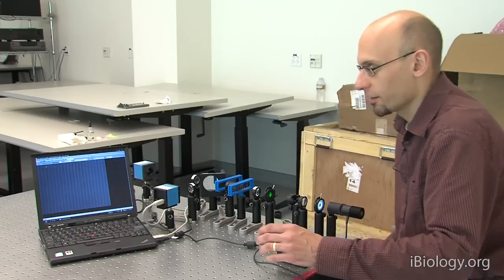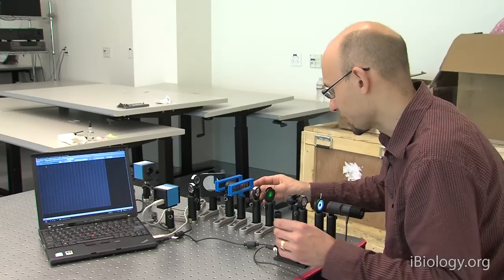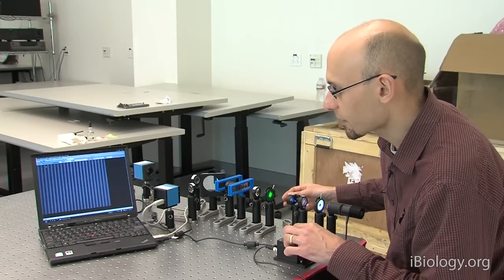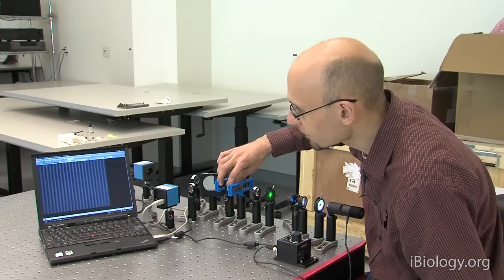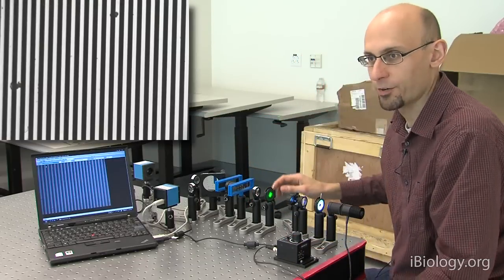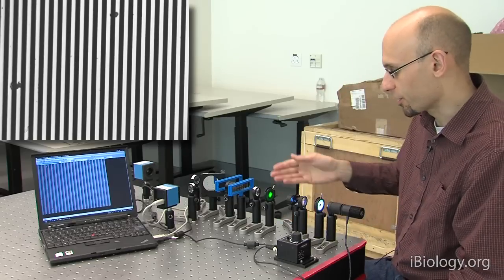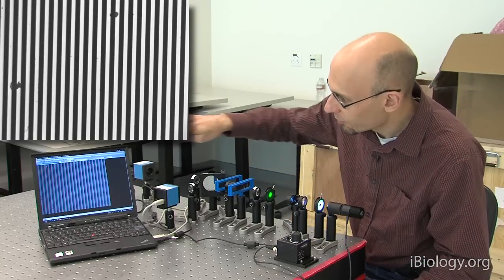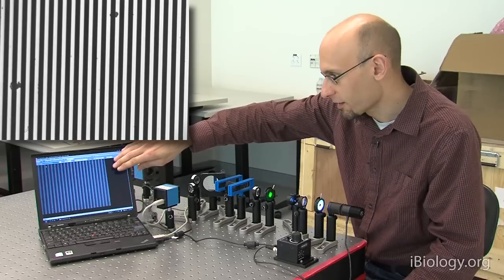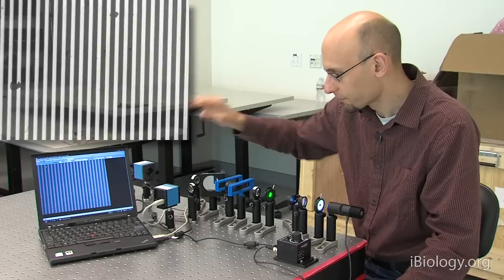So let me start here by focusing on a simple grating slide. So you can see here the sample that's in focus right now is just a simple pattern of vertical lines. So these are just metal lines deposited on a glass slide, and the metal lines don't transmit light, so they're dark, the glass transmits, and so it's clear.